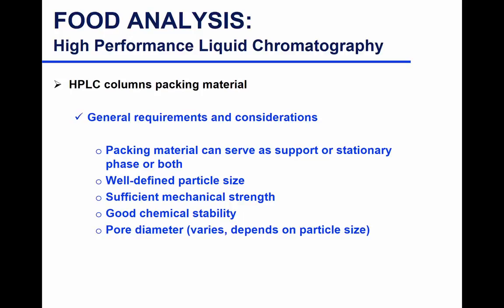So, in choosing a packing material, you want to make sure that you have a packing material that can serve as a support or stationary phase or both. Sometimes your packing material can be both your stationary phase and the support. Sometimes you have a support that is inert and you have a layer of stationary phase on it. So you want to think about what would work best for your system. Particle size would be great. The smaller the particle size, the better the packing, the better the resolution.